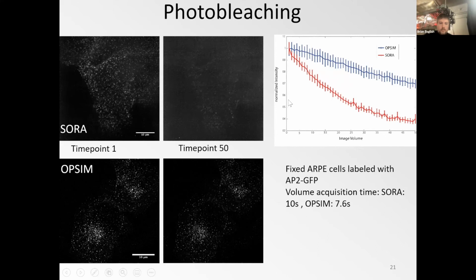So nevertheless, this is some hint that the light sheet format, so exciting only what you're looking at in any plane, pulls through to some degree also in the light sheet imaging, sorry, in the OPSIM.